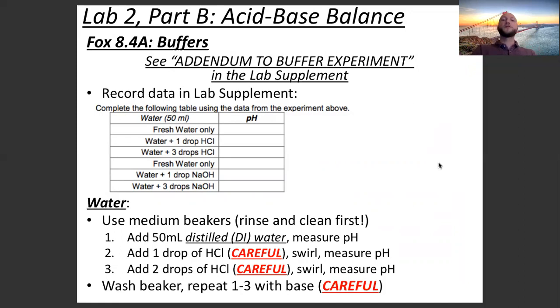So here's our setup. In this experiment, we're going to set up 1, 2, 3, 4, 5, 6 beakers with fresh water, and we're going to measure their pHs.